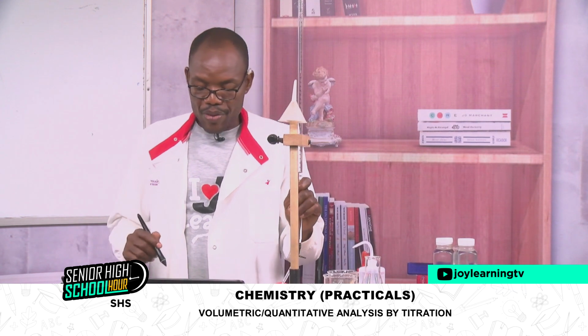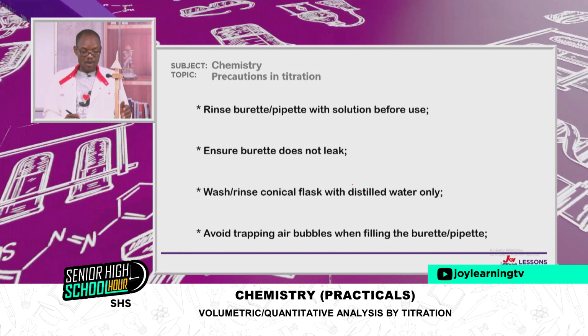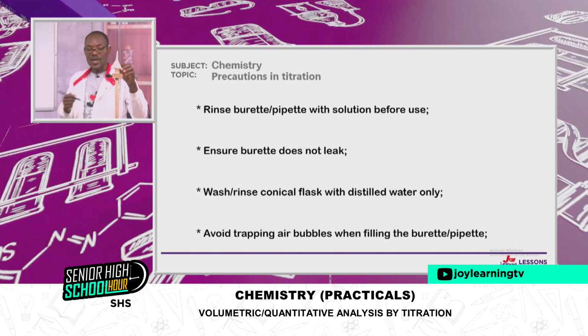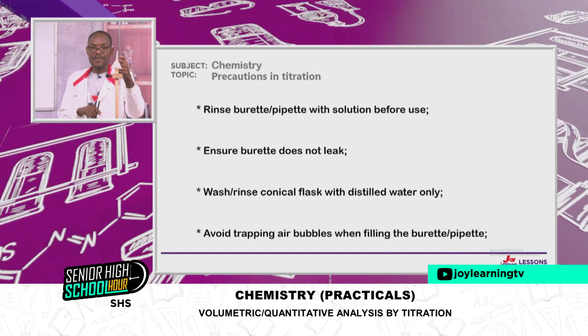Ensure that a burette does not leak. So if your burette is leaking, you take a value, you turn yourself, you come back, it's leaking, so you have lost some solution. That initial reading you have made is affected.